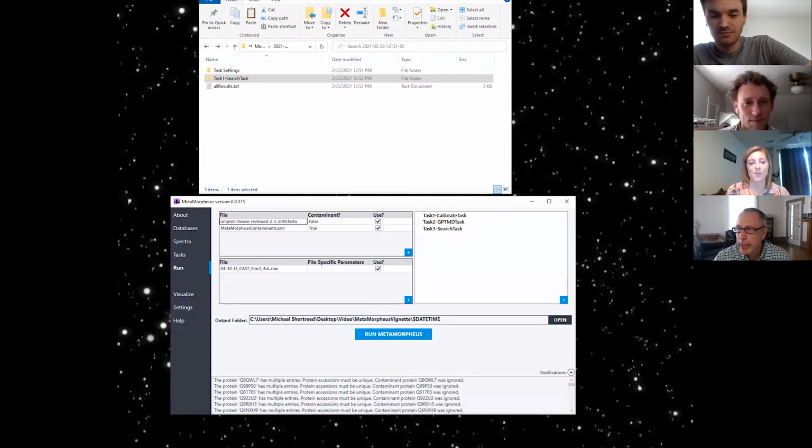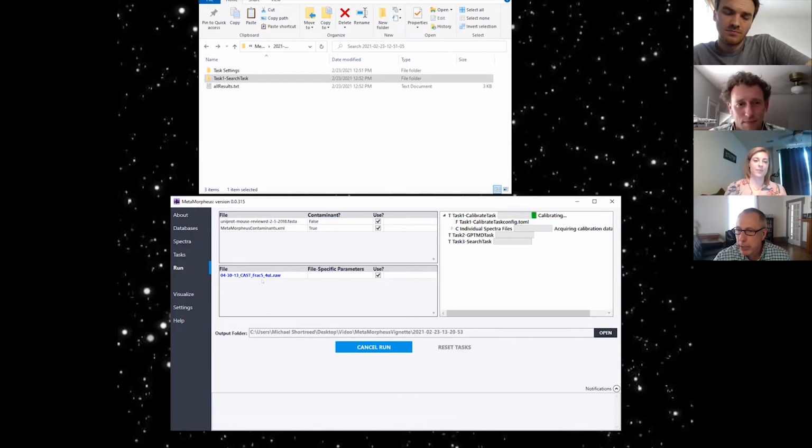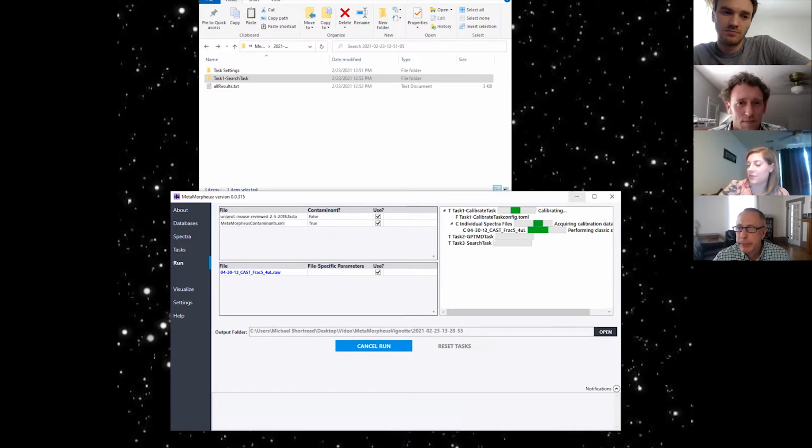So I still wanted to show you guys how the search is working, in some compressed time. We're going to have about 5 minutes to talk here. I'm going to queue this up, and you're going to see it go through each of these tasks. And some of the things we're watching for are some changes over here. So we should see a new file show up here with the tolerances, and we should see some new databases show up here that have PTMs in them. And just so Dr. Shortreed said this is going to take about 5 minutes on his. If we were to run it all the way through on mine, it's going to be about 40 minutes. So again, not unreasonable, but just for the sake of trying to keep this video concise and get as much information out there as possible.